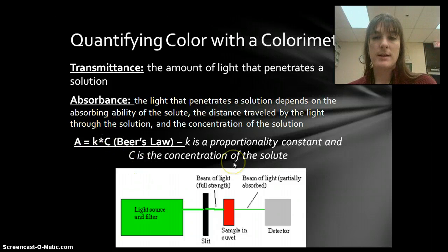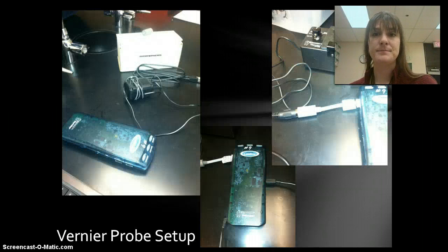So we know that absorbance is related to concentration proportionally. So if I was trying to find the concentration of something like the brown color in the guaiacol, I can do it using absorbance. If I can get a value for absorbance, that'll tell me a little something about the darkness of this color, which will help me in answering my questions.